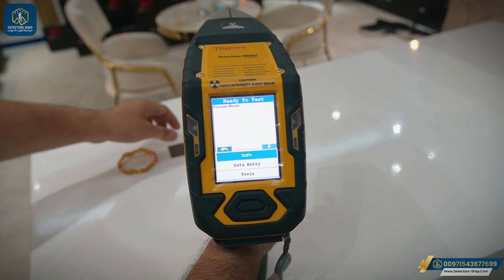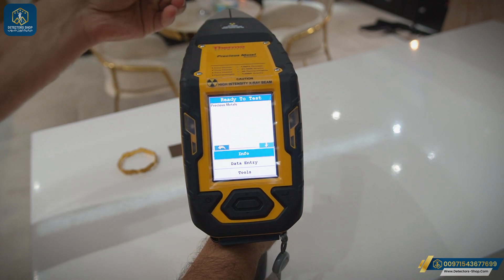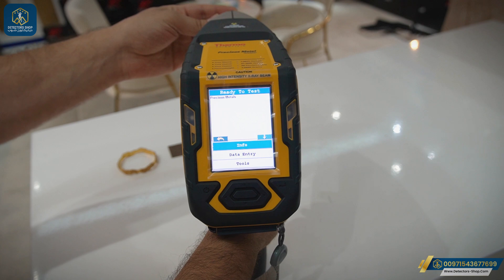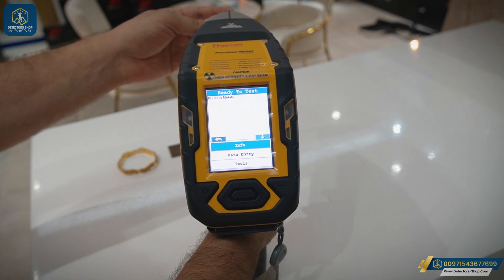We're going to choose the gold nugget for our experiment. Now we're going to place it at the front of the pointer and then press the trigger for 20 to 30 seconds.